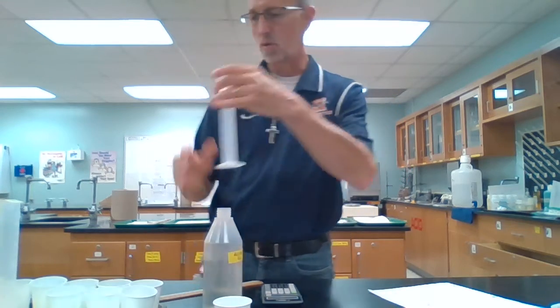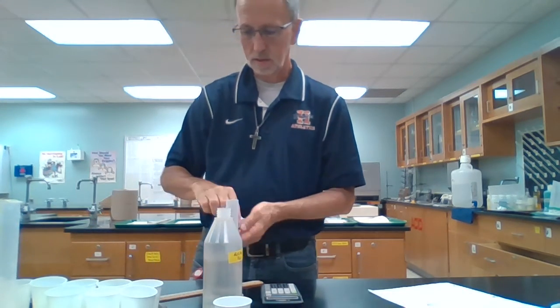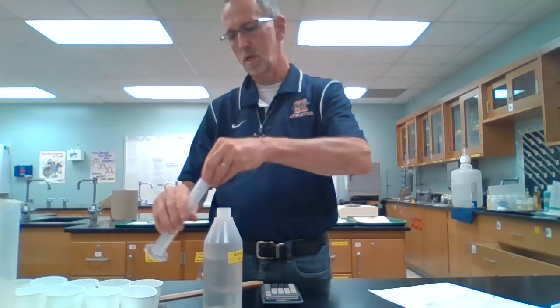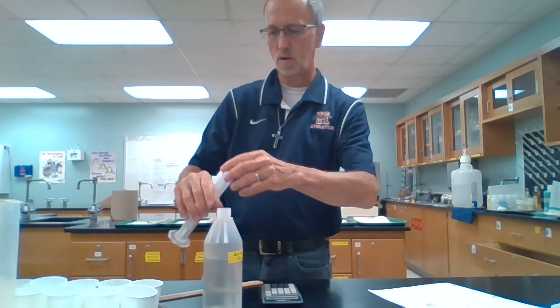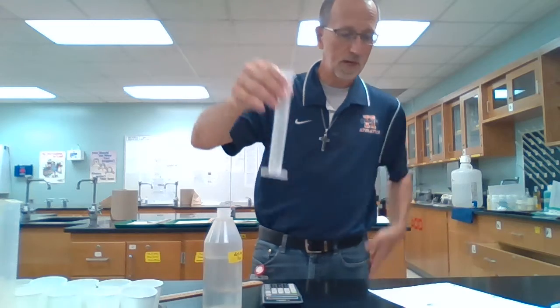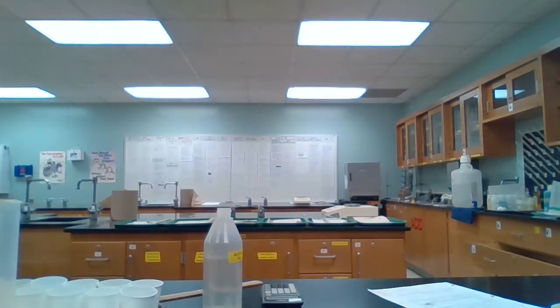Don't really need that much water. There we go. Note the volume. Put these pieces in here. Again, make sure when you put those in not to splash the water out. Okay, looks like that one went up about 5.2 mLs.